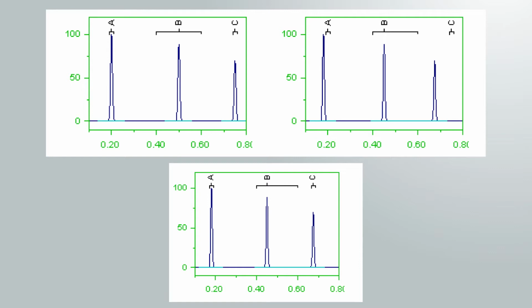Before assigning peaks to components, the integration algorithm first scans the component list for retention time references. If any components use another component as a reference, then the peaks under the reference component's window are compared, and the peak with the largest area, not necessarily the centermost peak, is selected. If this peak's area fails to exceed the value of the reference peak area reject threshold, then no windows are moved. Otherwise, the ratio of the reference peak's actual and expected retention times is formed, and the windows that use this peak as a reference are moved proportionally. The three figures illustrate retention time referencing.